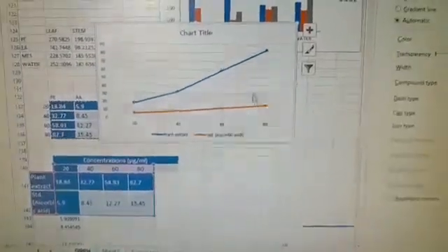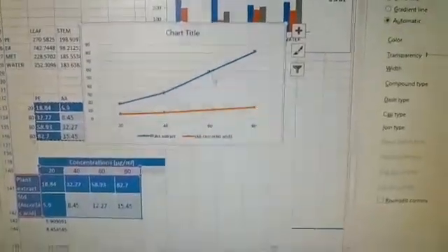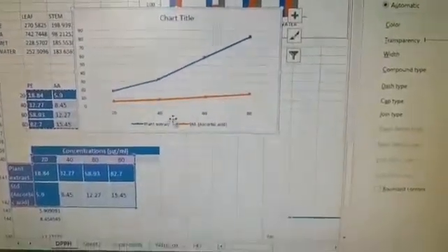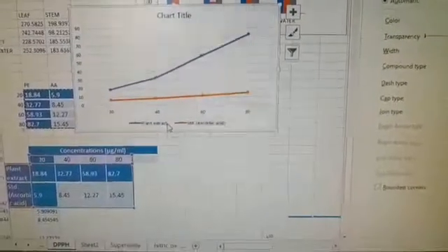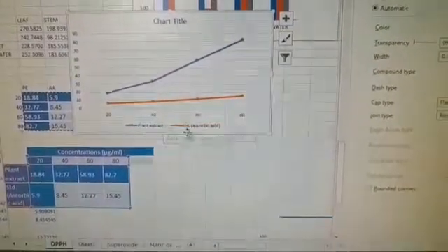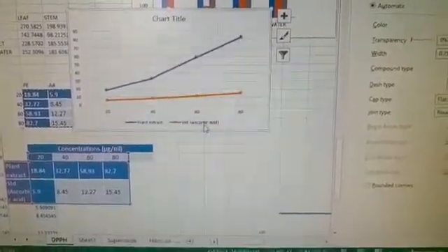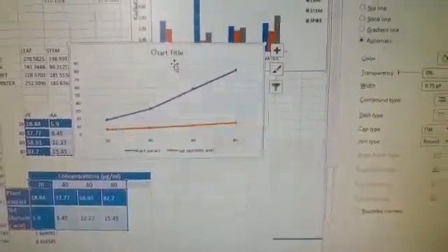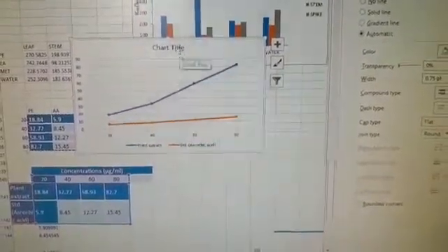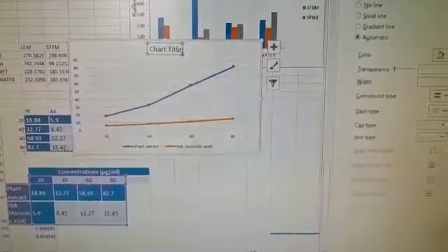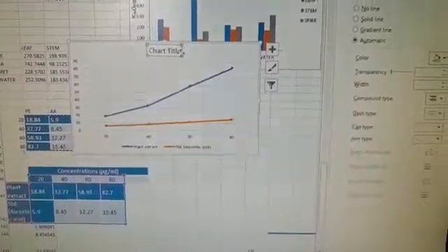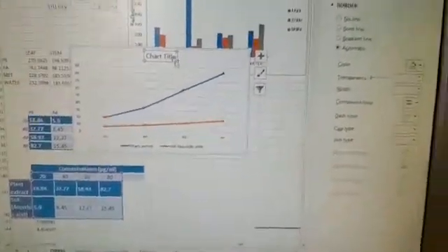You get a graph like this. The blue color is plant extract and this is ascorbic acid. Select the title and you can write DPPH activity or DPPH assay.